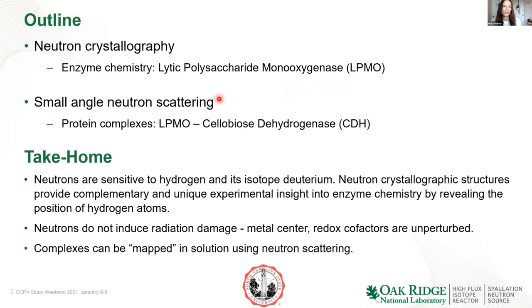If I have time, I will also show you how we can use neutron small angle scattering to look at complexes. And here we're interested in looking at the complex of LPMO with its redox partner.